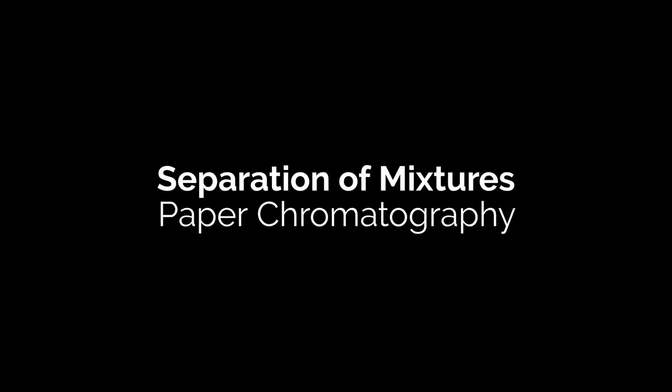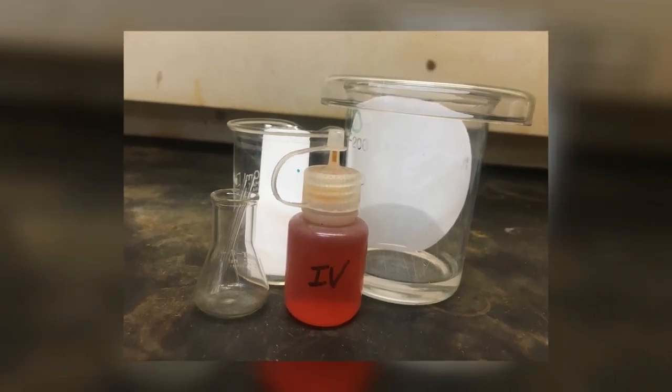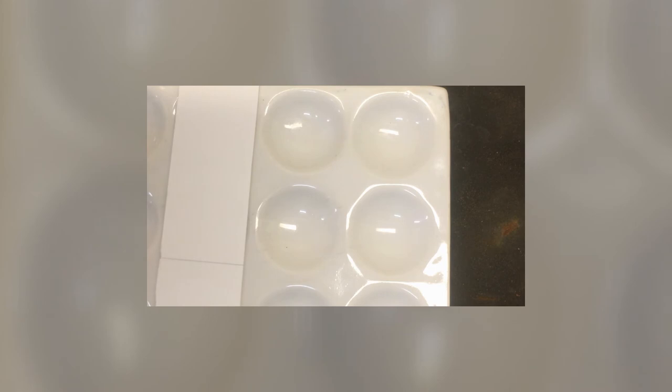Lastly, we will be doing paper chromatography and this is what we will be working with today. The mixture is applied to the baseline in a spot and allowed to dry.